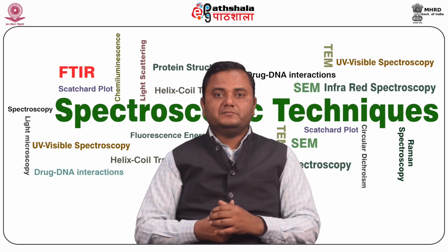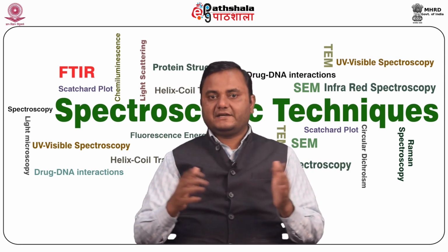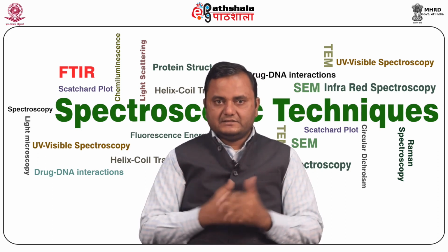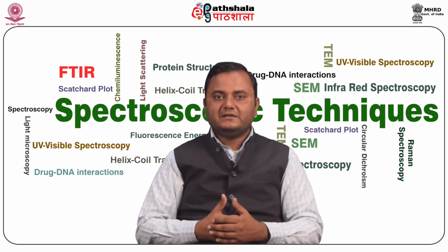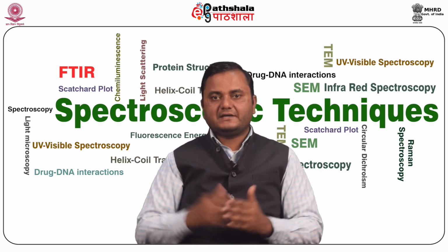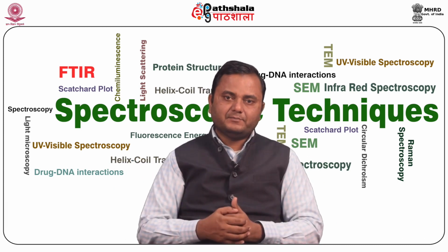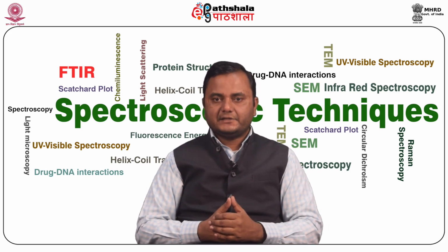Now it is important to note that the peak intensity shows the effect of these factors. These factors actually decide the peak intensity. For example, a strong peak is tall when transmittance is low. A medium peak is mid height, and a weak peak is short and transmittance is high. A broader peak appears if the Gaussian distribution is abnormally broad, and this is more for describing a bond that spans many energies. The exact transmittance values are rarely recorded.